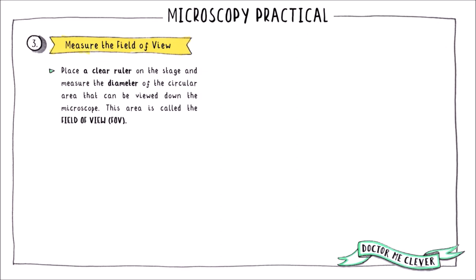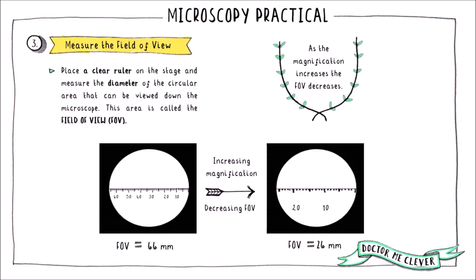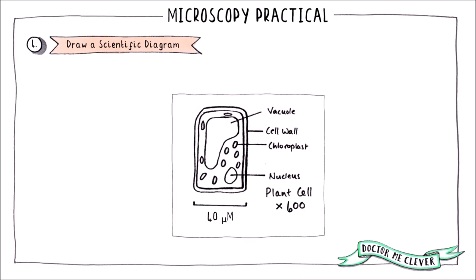To measure the field of view at any given magnification, take a clear ruler and place it on the stage. Look down the eyepiece lens and measure the diameter of the circular area that you can see — this measurement is the field of view. As you zoom in by selecting a higher magnification objective lens, the image size stays the same but the actual field of view decreases, so you will need to re-measure the field of view at higher magnifications.